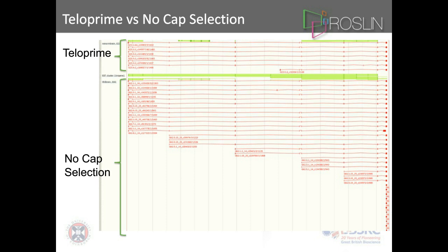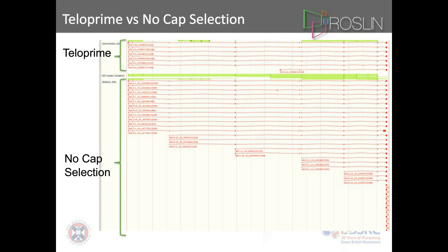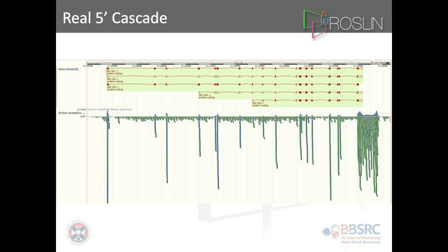Looking at sequencing efficiency: in the TelePrime library versus non-cap-selected, the non-cap-selected shows all these 5' cascading exon models representing degraded RNA. All of those degraded RNA reads are useless for transcriptome annotation because they don't represent a true transcript. Inversely, there are situations where you have real 5' cascades — as Ensembl predicts — that are real transcript models. Without cap selection you could never identify these, because they look just like a degraded product. With 5' cap selection, you have more assurance that this is a true transcription start site.